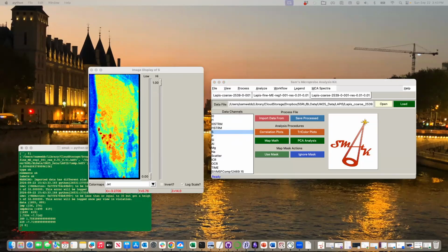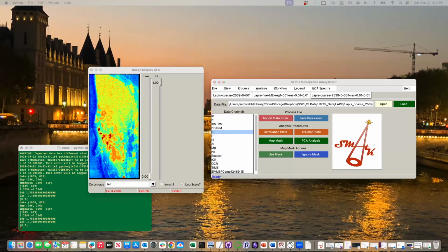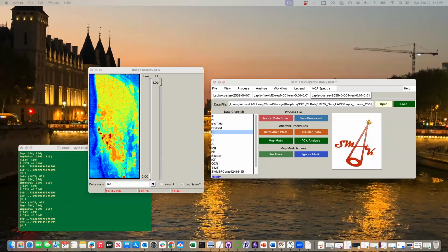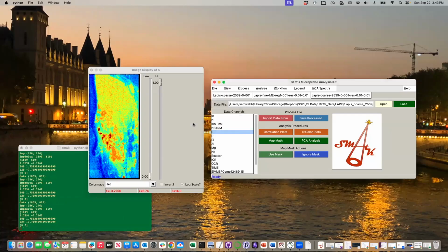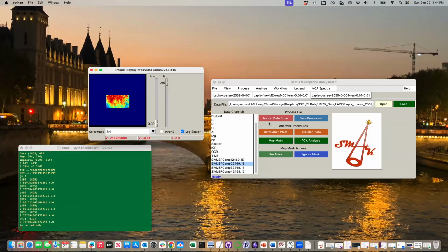And I'm going to do that with all the other ones here too. They're off screen, but we'll deal with that and just say, okay, okay, okay. How many more of these do we have? Okay, okay, okay. And so now, boom, there they are. And we could even say, let's zoom in on this section in here. All right, there we go.